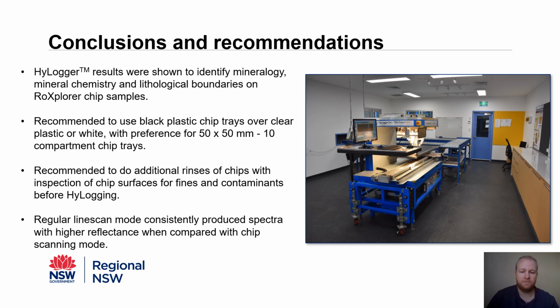Additional rinses of chips with inspections of chip surfaces for fines and contaminants before HyLogging. Preference for this would be at the drill site. Lastly, using regular line scan mode for HyLogging.